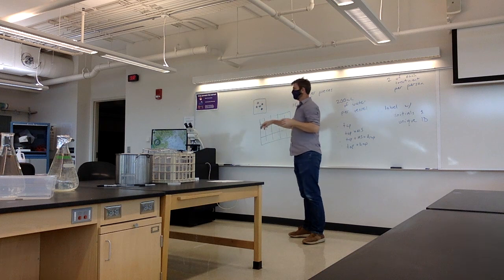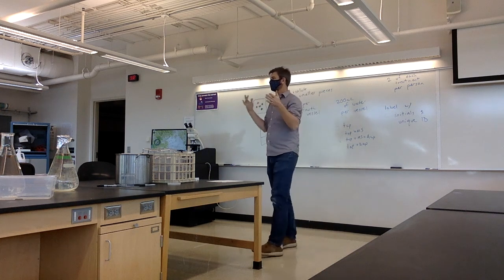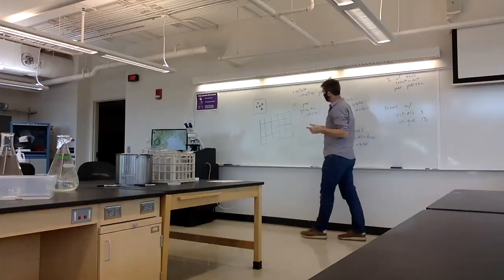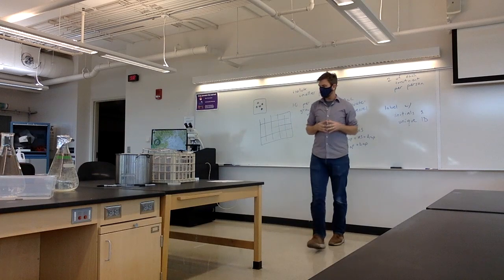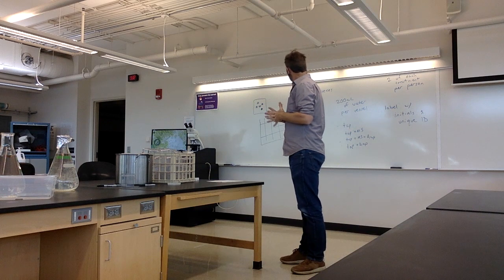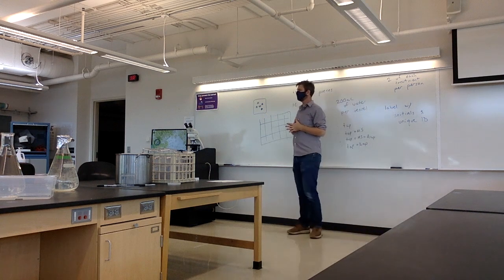and there might be different light hitting each of these rows. So if we give the different treatments different light, then we might see an effect that's based on the light that's not based on the nutrients. So if we randomize, that basically allows us to cancel that out. Or we could even keep track of their position and see if that has an effect later on. But I can do that as we go. We'll just use a computer-generated random number to assign where they're going to go.